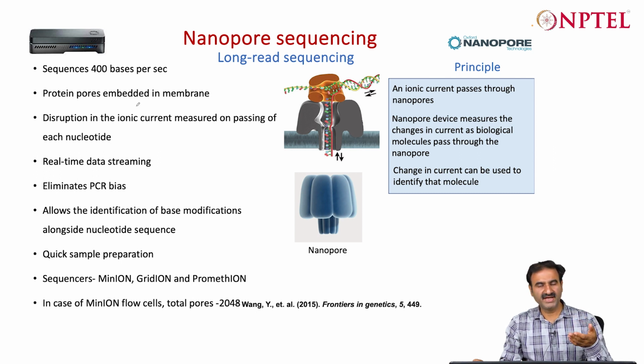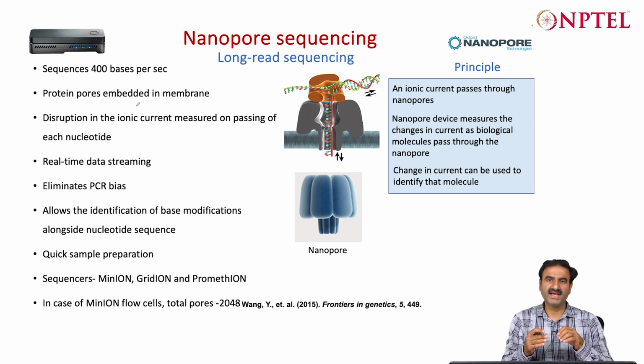And also for DNA sequencing, because these generate very long reads, if after correction for errors by the Illumina reads through the hybrid approach, they can help to build very long contiguous assemblies with a very high N50 and other quality values.